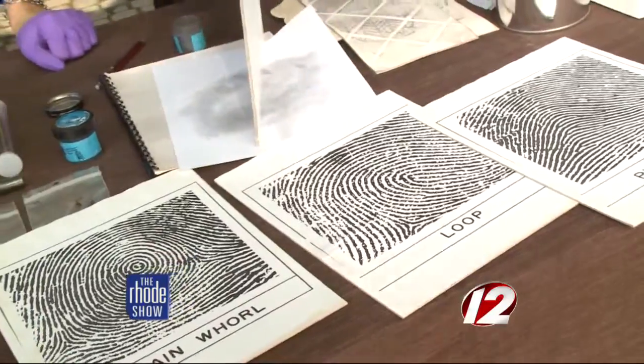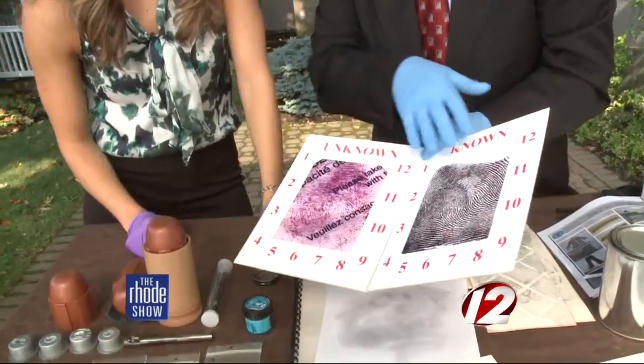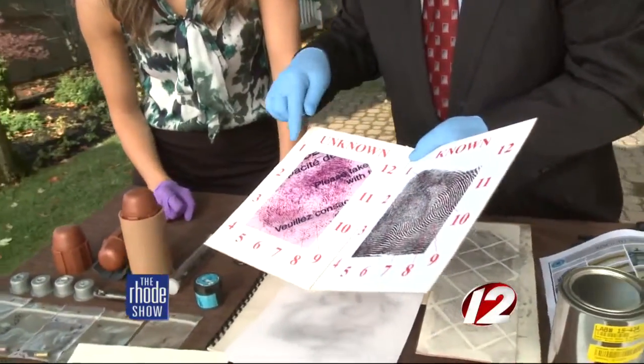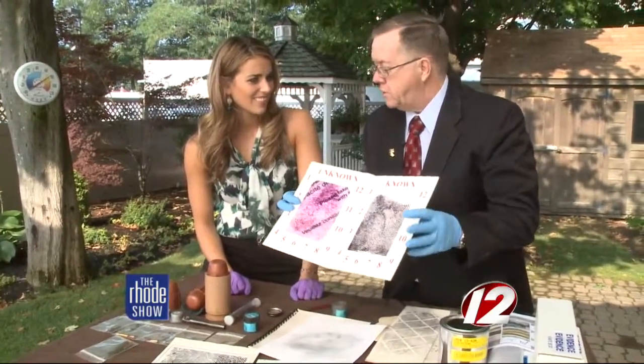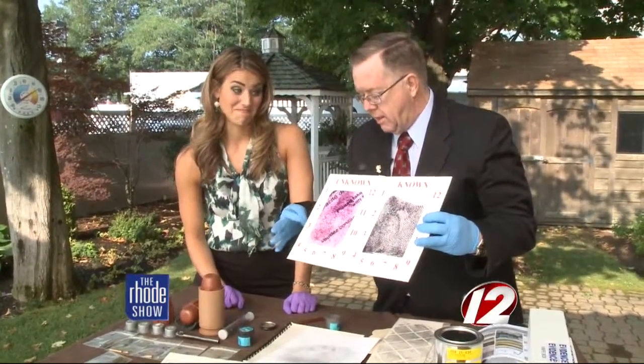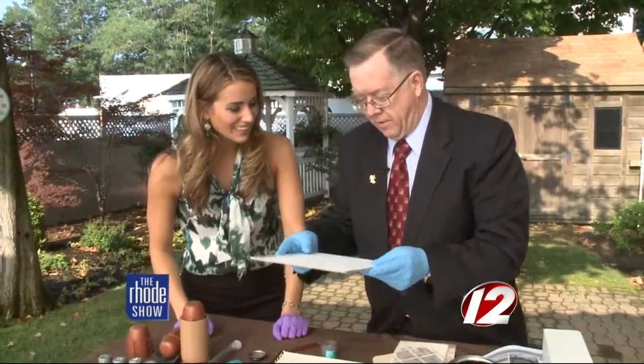So we would take your known print and chart it, and we would then compare it to the print that we developed. This would be our unknown print that we developed here, this would be your known print, and then they go in and find those 12 or so different points. This would be a presentation to the jury, and the examiner would say that this print came from this person.